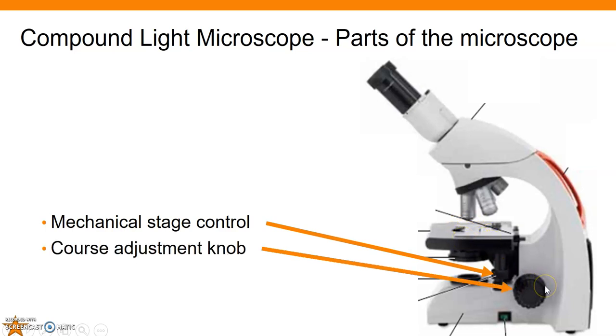Then we have the adjustment knobs, which are going to help you to focus. If you look at this, it's a little hard to see from this view, but there's actually two knobs here. There's a big fat clunky one at the back that I'm pointing to right now called the coarse adjustment knob. Then there's a finer tuning one, a smaller one that is farther out on the microscope. They are attached, but there are two knobs there. This is the fine adjustment knob. The coarse adjustment is going to move the stage really quickly and not very carefully. That is just going to move your stage up and down. The fine focus is going to move the stage up and down, but it's going to do it in a much more controlled manner. This is not going to be used as long. Coarse adjustment is typically used to get things quickly, slightly visible. Then the fine focus is what's used to make things look picture perfect as you are trying to look at whatever specimen is going to be on your slide.